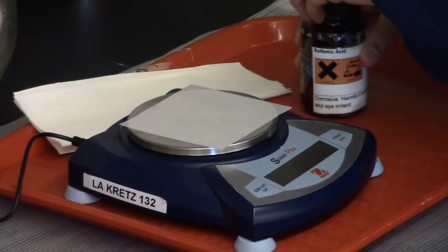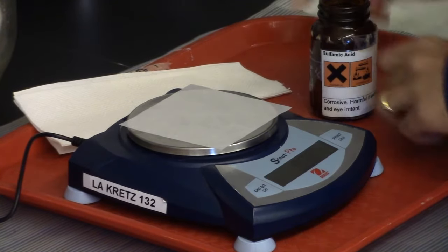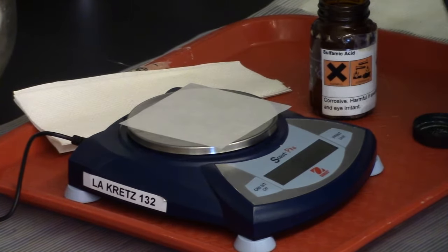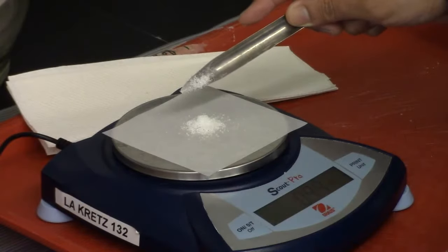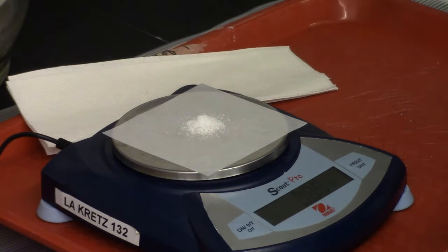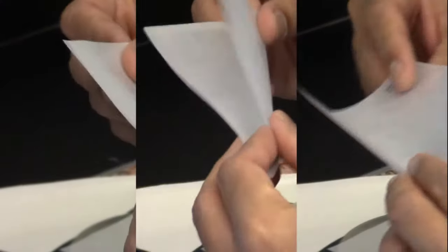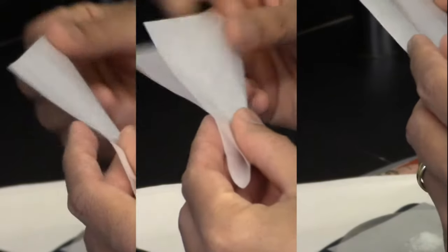Weigh out about 1 g of sulfamic acid on a weighing paper using a centigram balance. Label 3 more weighing papers. Fold papers on the diagonal.